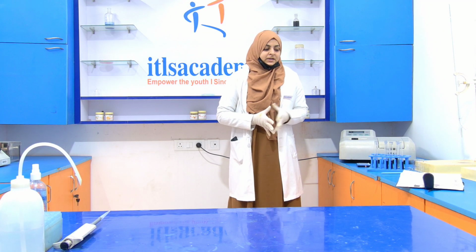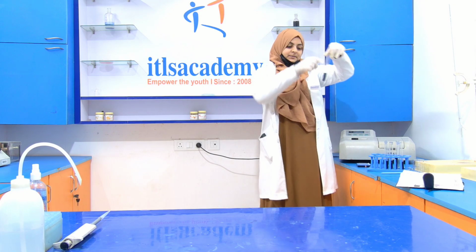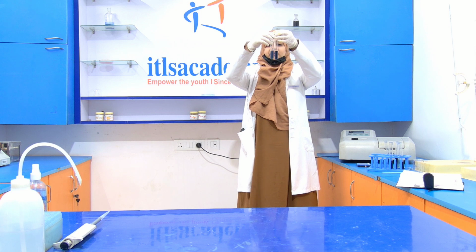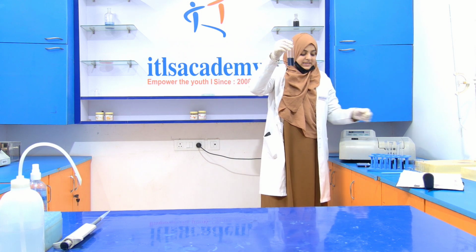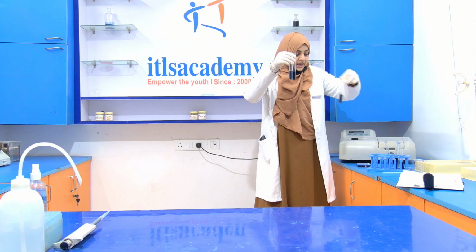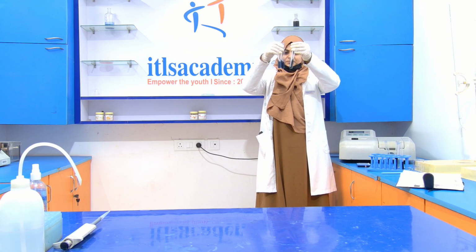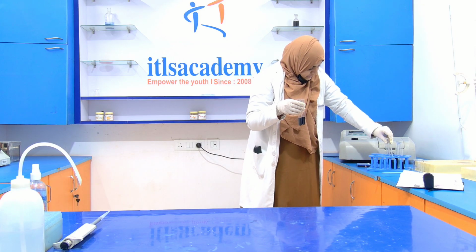Now, after the incubation of 30 minutes, we get this color. You can compare the color of the test tubes: as the concentration of BSA increases, the color of the test tube also increases.